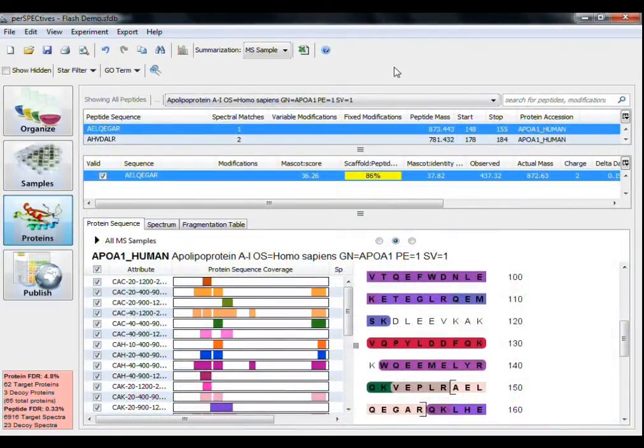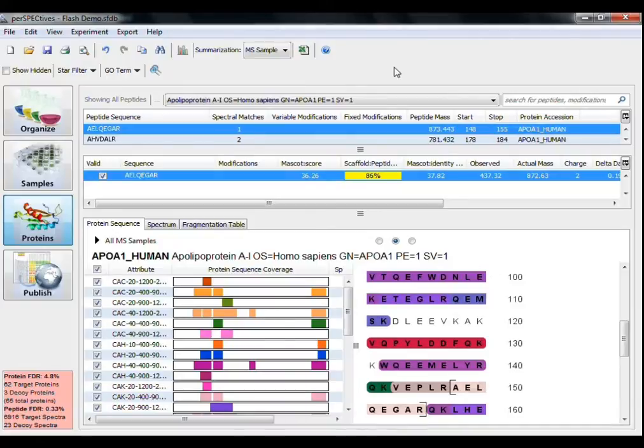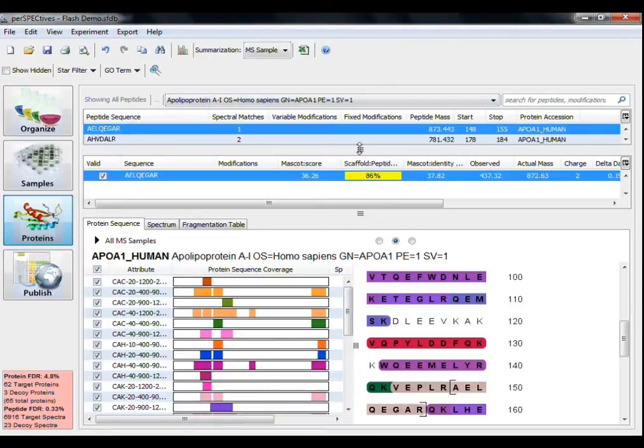As with many of the other programs in our scaffold software suite, the Proteins view in Perspectives looks at each individual protein, peptide, and spectra in greater detail. There are three information panes in the Proteins view, the Peptides pane.